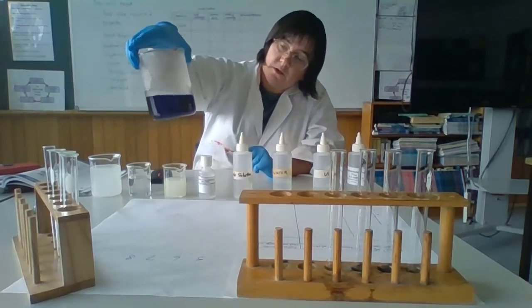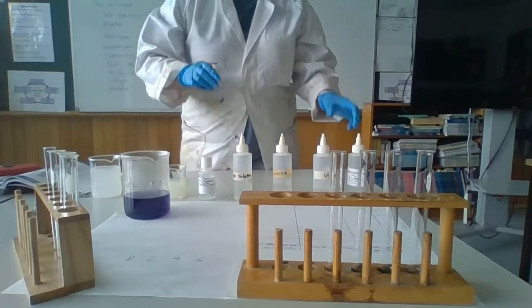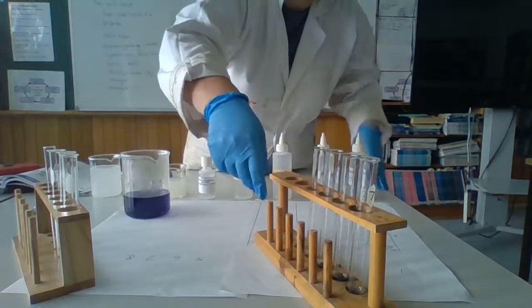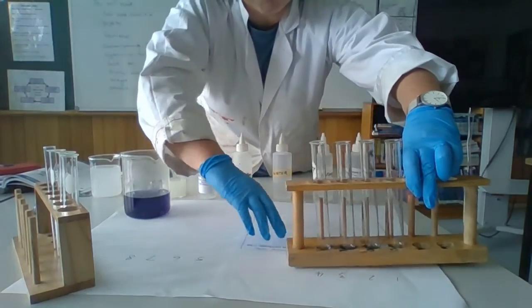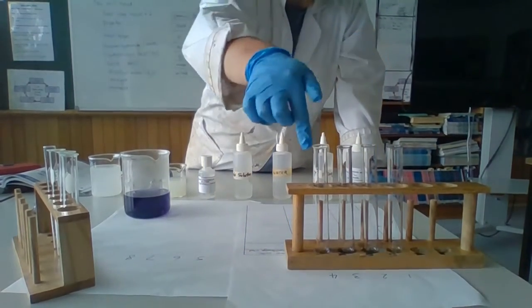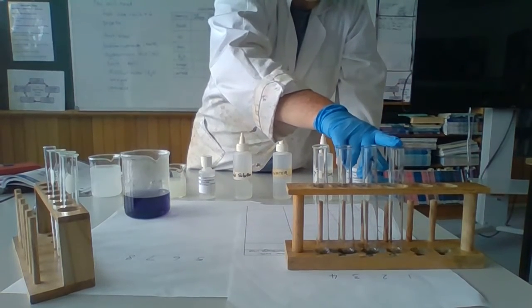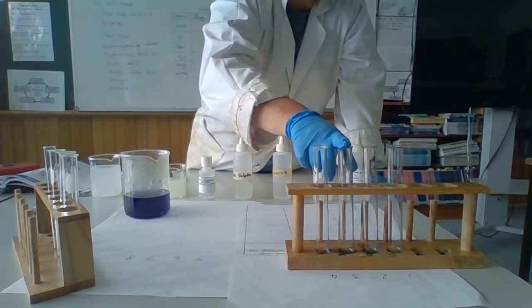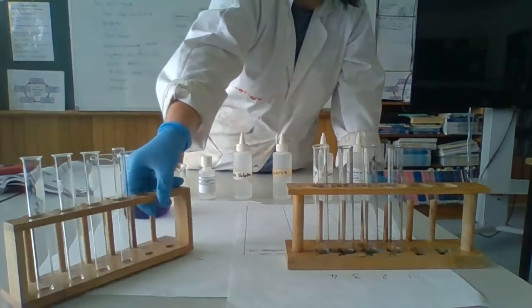purple red cabbage indicator. So what I'm actually going to do is, if I turn these around so that you can see the colour that they go. So these are just some test tubes, and I've just labelled on the piece of paper 1 through to 4, so that I know that this is going to be the number 1, number 2, number 3, number 4. So that's our strong acid, weak acid, neutral, weak base. And then the last 4 in this test tube rack.